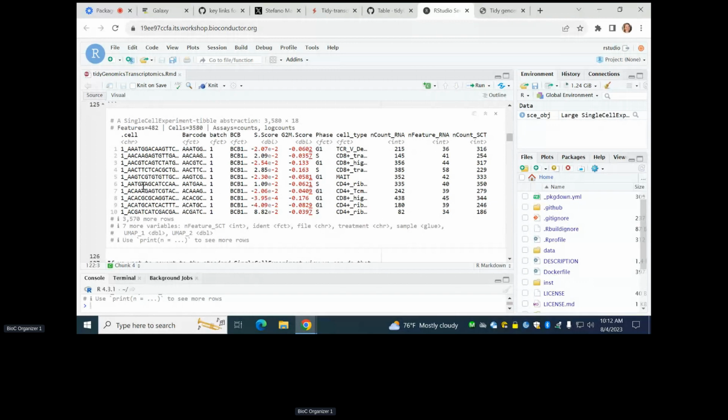Yeah, so there is no package that will ever know that these tidyomics will be loaded. There is no trace. So, is it just that by importing or loading tidySingleCellExperiment there is a new show function? Correct. Exactly. And the show function also merges the manipulation you do, so you have this consistent appearance interface. Yeah. So this is the colData of the single cell experiment?